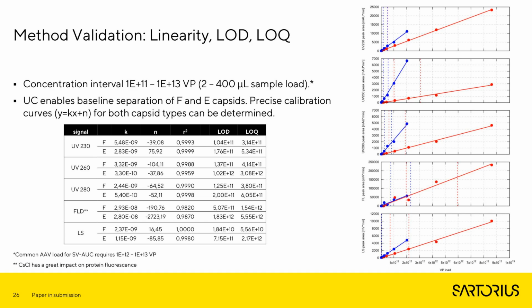Regarding the LOD and LOQ, I want to mention that still, even though the LODs and LOQs are not as great as with chromatography, this approach enables us much better sensitivity compared to sedimentation velocity ultracentrifugation, analytical ultracentrifugation, where typically at least one order of magnitude more sample is needed to obtain, let's say, relevant signal responses.